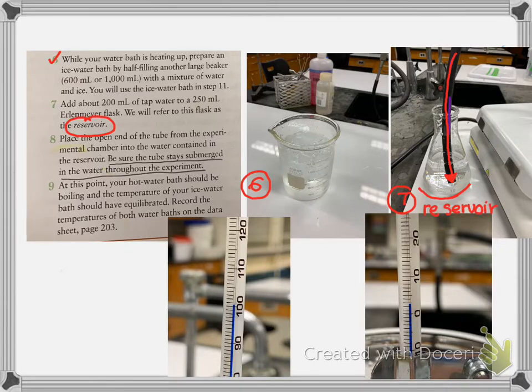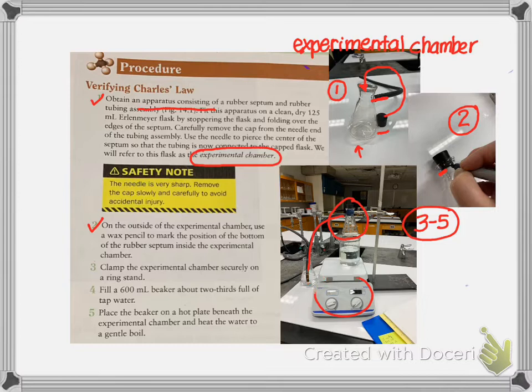Now let me go back and erase the marks that I had on this so you can see the whole setup. What I have here is the experimental chamber.